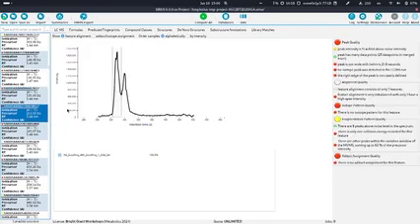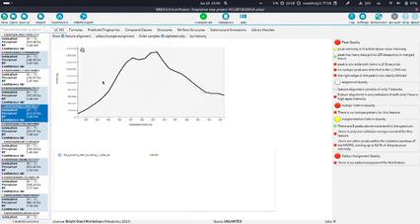Yeah, this is a good example. Now you will see the peak, but you will actually see a gray box here. And if you zoom on this gray box, I will do it soon, this is actually what the feature corresponds to. So this is actually the peak of the feature which we are looking at here.